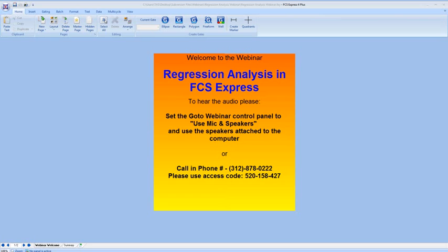I also want to add a note here that this webinar is going to build upon your prior knowledge of, I guess, the basics in FCS Express. So we're not going to go over how to create gates, how to create custom data, and how to insert bar and scatter plots and all that.